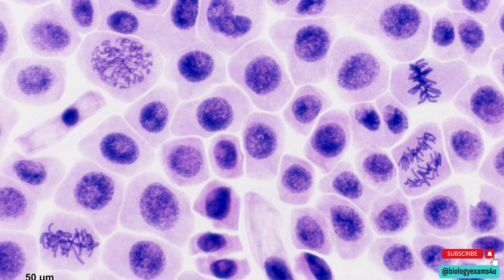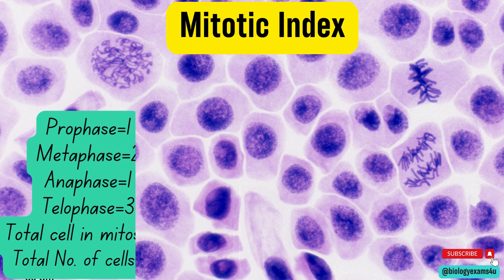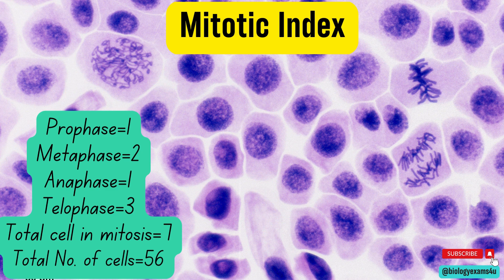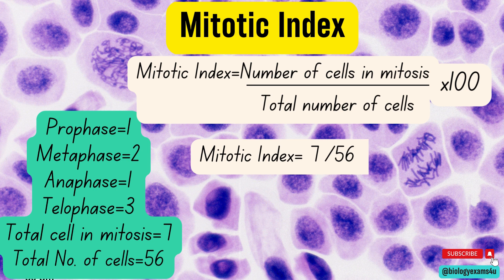Now we have the number of cells undergoing mitosis, so it is very easy to calculate the mitotic index. First, count the total number of dividing cells: prophase one, metaphase two, anaphase one, telophase three — so the total number of dividing cells is seven. The total number of cells in this field is roughly 56, counting both dividing and non-dividing cells. Therefore, mitotic index equals total number of dividing cells divided by total number of cells — here it is 7 divided by 56, that is 0.125, or 12.5 percent.